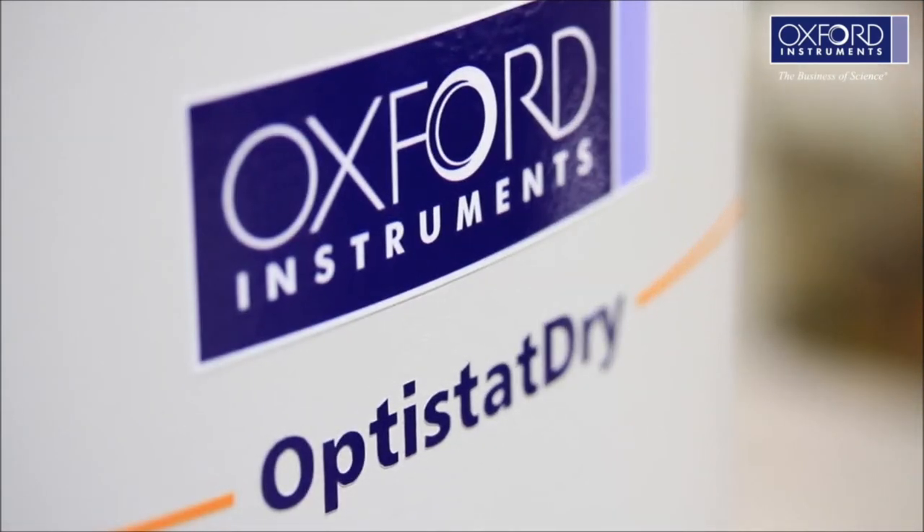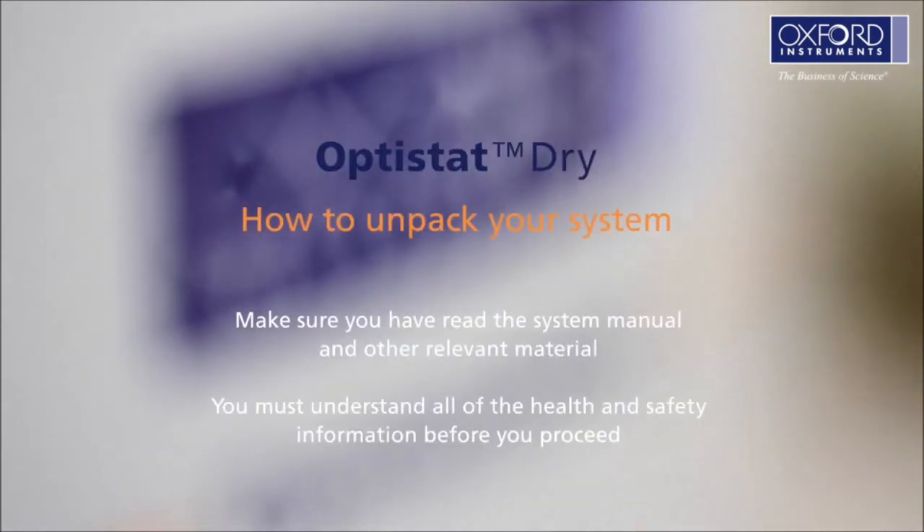Welcome to Oxford Instruments' video guide to the OptistatDry: how to unpack your system. Make sure you have read the pre-installation guide and understand all of the health and safety information before you start to unpack your system.